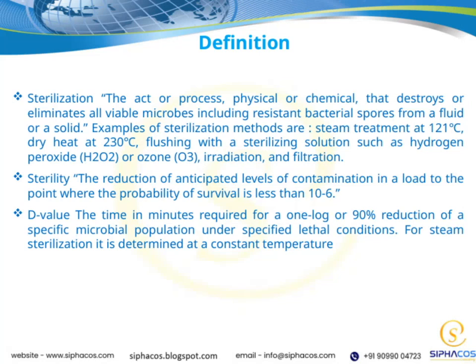Let's start by looking at sterilization. Sterilization is essentially the process, whether physical or chemical, that eliminates all viable microbes. This includes even the most resistant bacterial spores, which are often the toughest to destroy. The goal is to ensure that no living microbes remain on a fluid or solid.